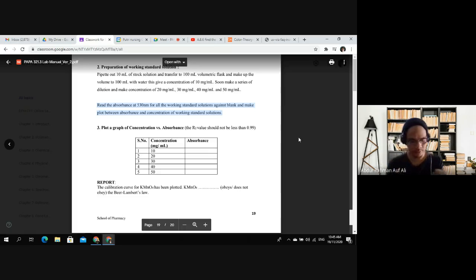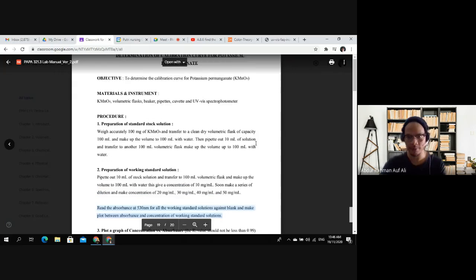Okay, so with that in mind, that is how we determine the concentration of solution, and also we identify the compounds yang ada di dalam any mixture, any larutan, any tablets, any suspension. Kita boleh detect, because the electrons in the atoms of the compounds absorb and emit energy at a different level, because different atoms have different amounts of electrons. Okay, that is the principles, the introduction for these two experiments.